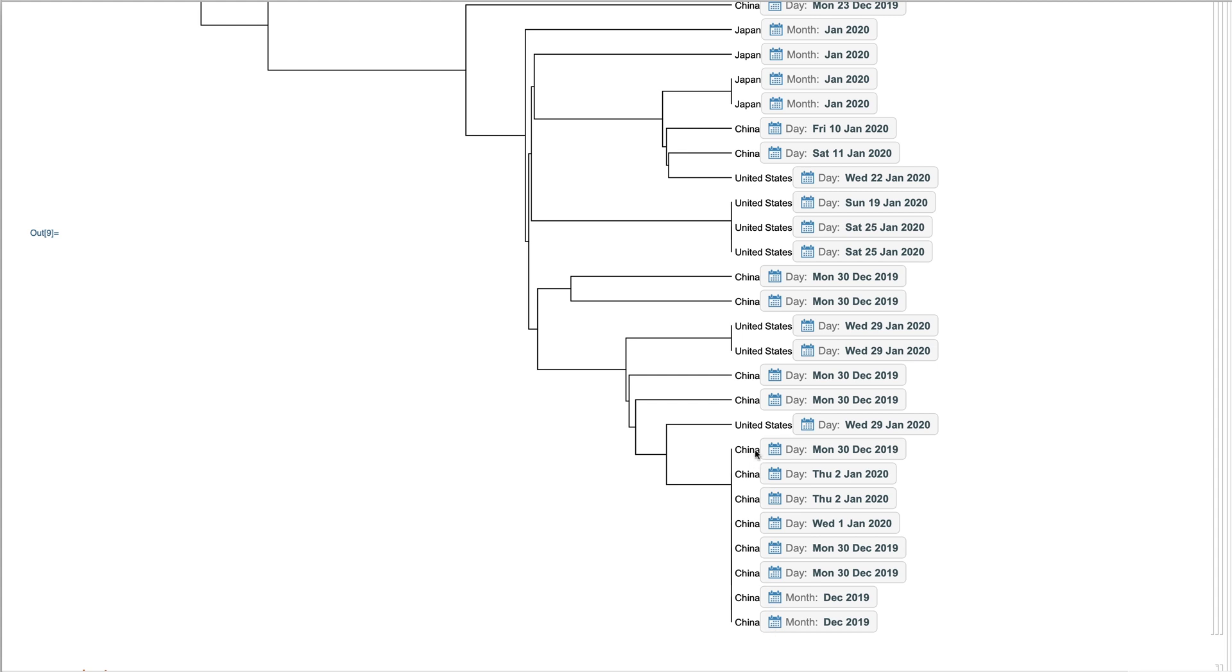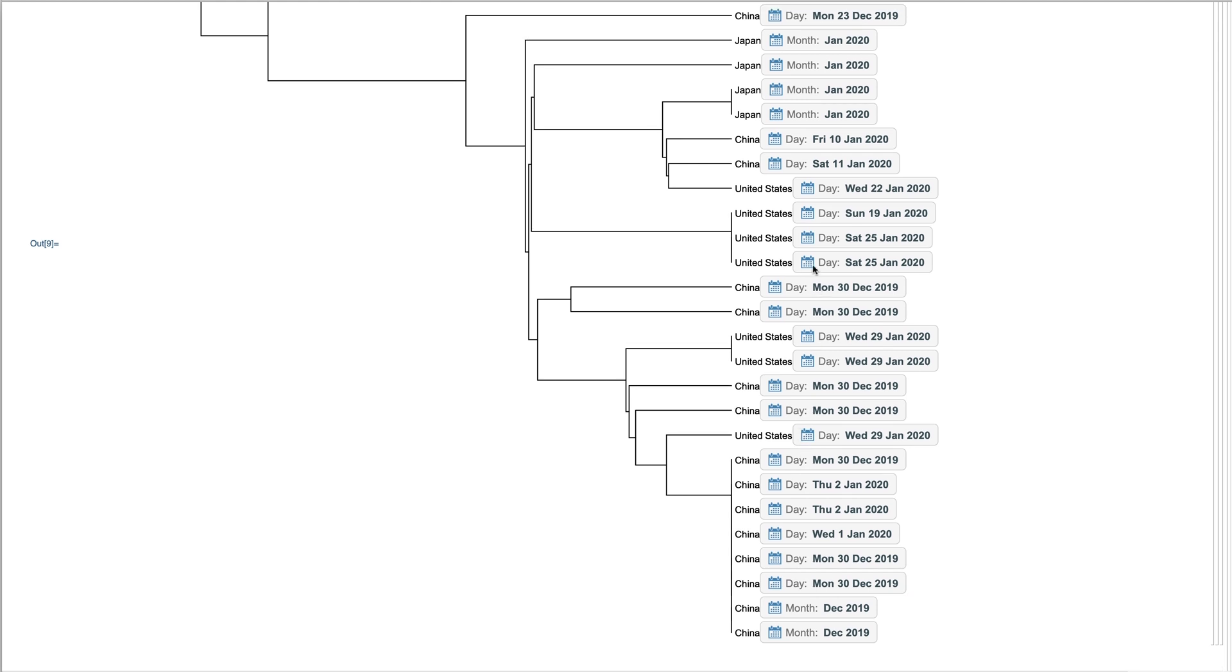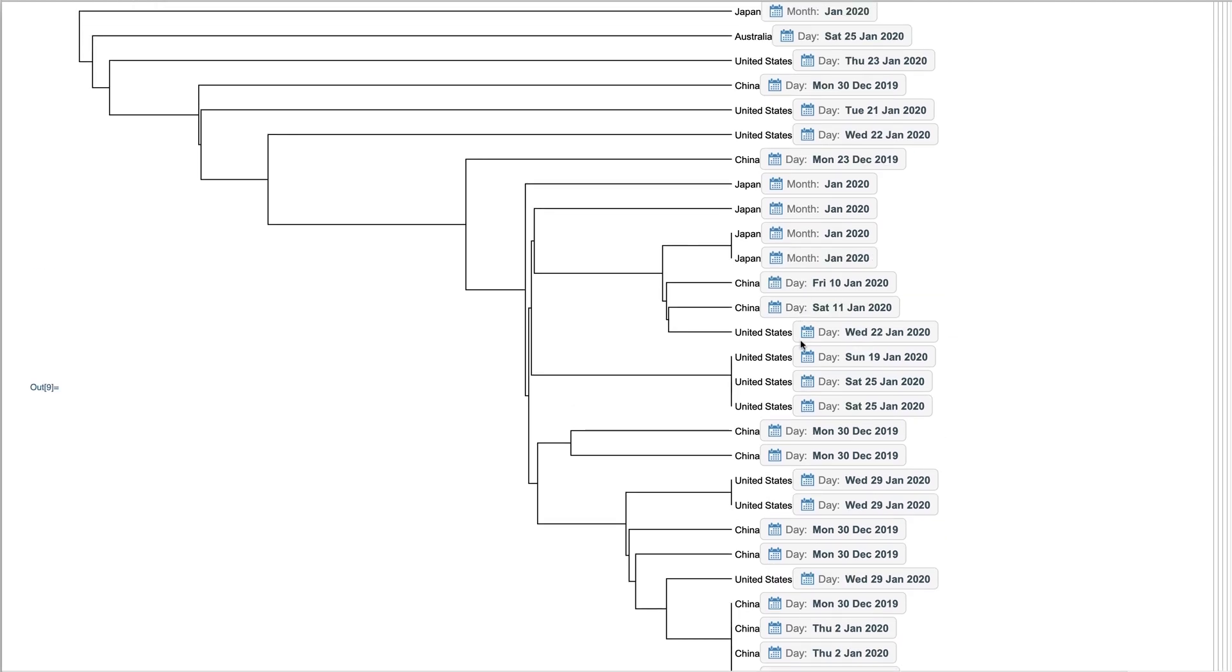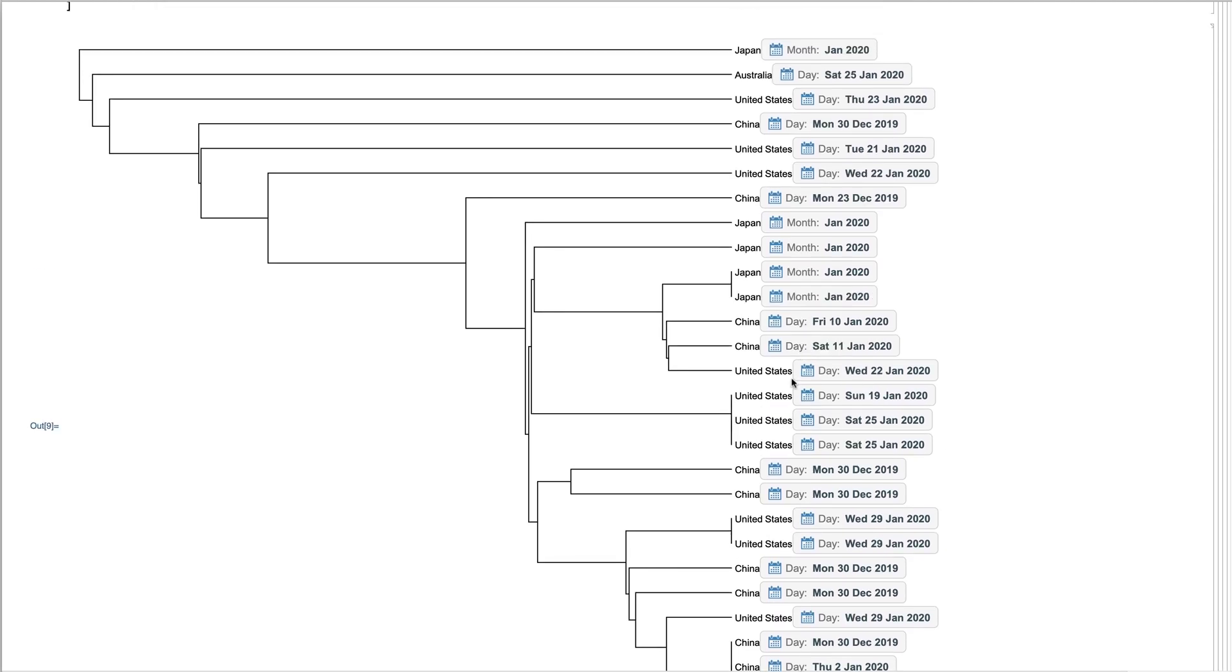This analysis shows that a lot of the early Chinese sequences are very closely grouped together. Some of the later United States sequences are close together.